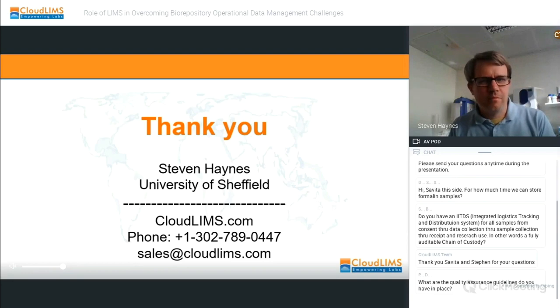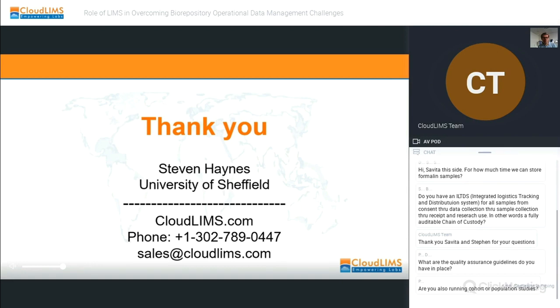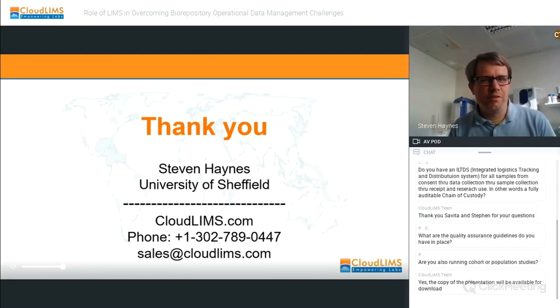So your answer actually brings us to the next question very beautifully, which is, what quality assurance guidelines do you have in place at your biobank? Okay, so we are linked very closely with the National Health Service, so we tend to follow the good clinical practice guidelines within our biobank. And we're also governed by the Human Tissue Authority here in the UK, so we also adhere to all their guidelines as well. And of course, we have internal university guidelines to follow.